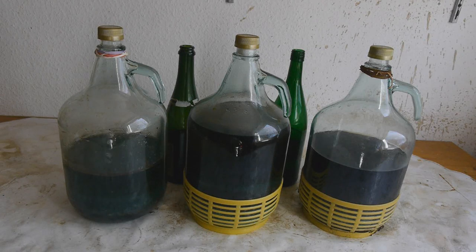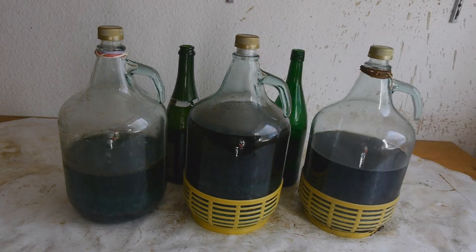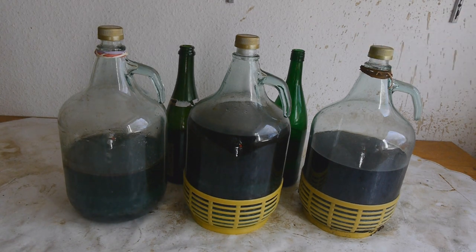Hello everybody! Whenever I want to make hydrogen balloons, I have to produce the hydrogen myself. And I usually do this by letting steel wool and sulfuric acid react. Now this obviously leaves me with a lot of iron sulfate solution that I don't have any uses for at all. Also, I can't just simply pour this down the drain, so I need to deal with this somehow.